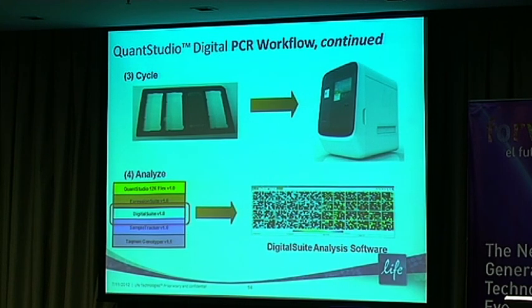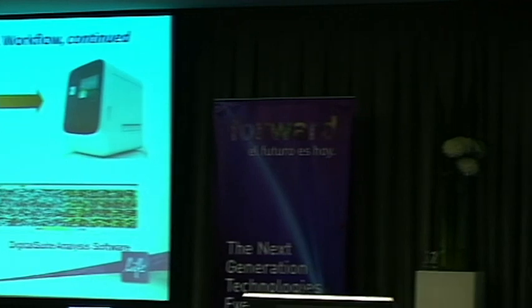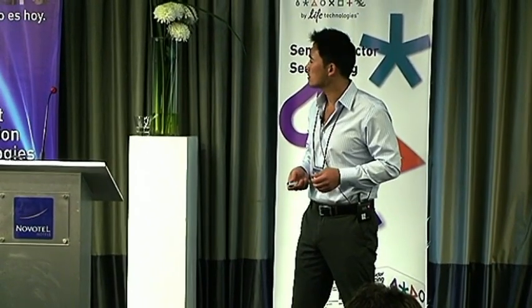You're just basically distributing, running PCR, and then just getting a count. I forgot to mention why we call it digital PCR. Did anybody figure out why it's called digital PCR? It's just a binary determination, right? Yes or no, yes or no. Is the well black or did it light up? So that's why we call it digital PCR, like ones and zeros with computers.